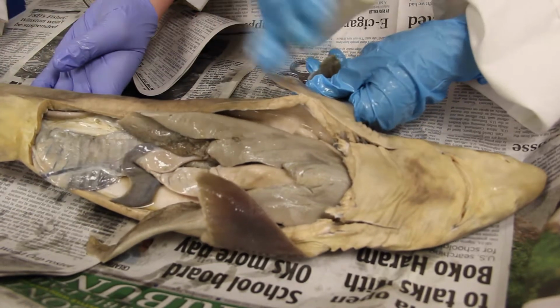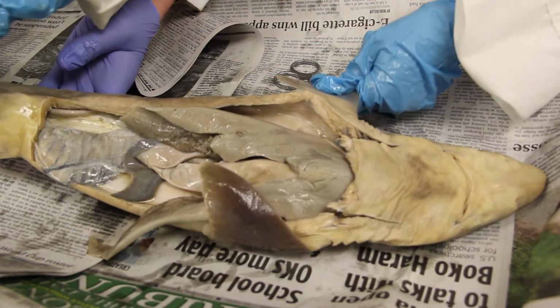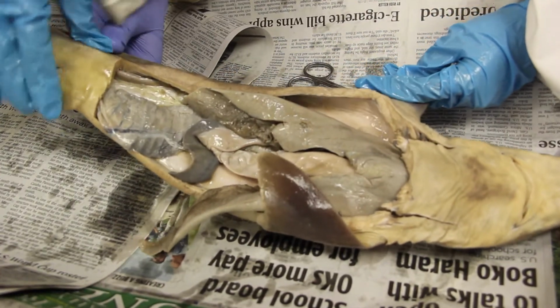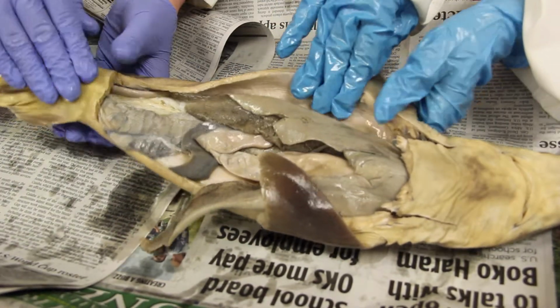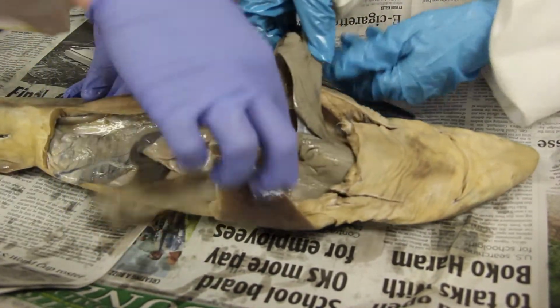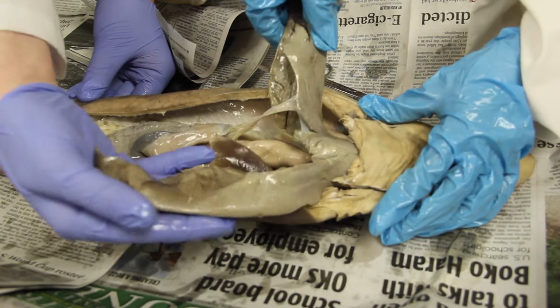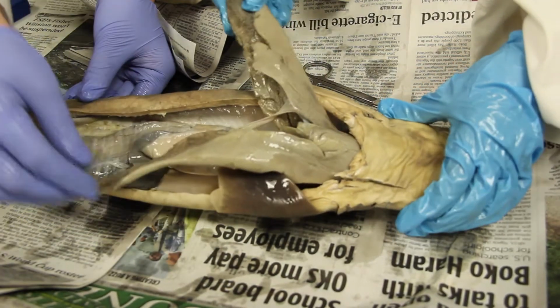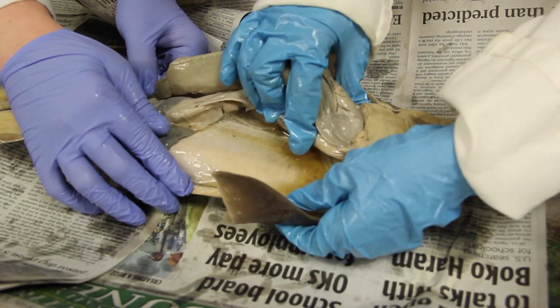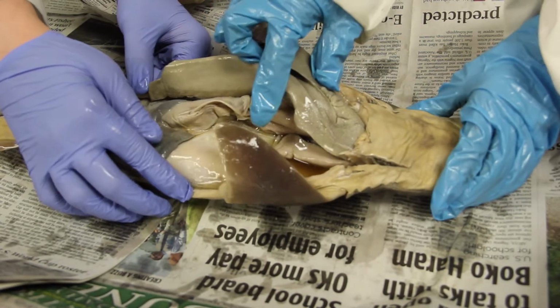Then the food goes on to the large intestine and the cloaca, with the rectal gland and the colon, which are all part of the excretory system, which would all be under here. And then the largest organ here is the liver, and the liver has 3 lobes, which creates oil, which helps, like Emily said, with buoyancy. And that's why you can see all this oil right here. This is all from the liver, which helps him float.